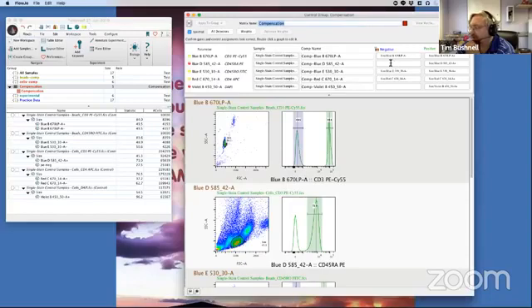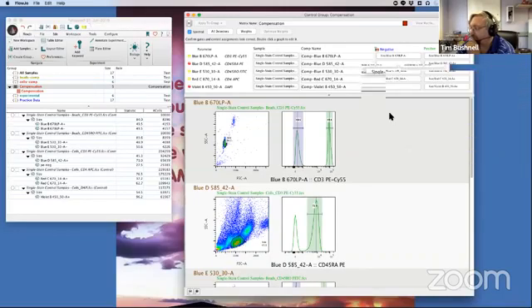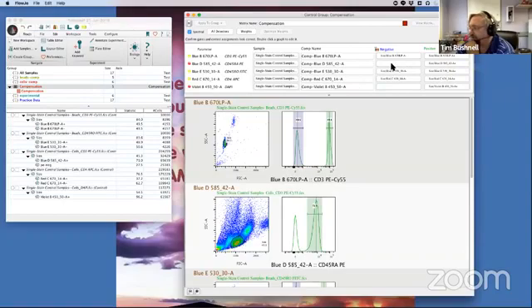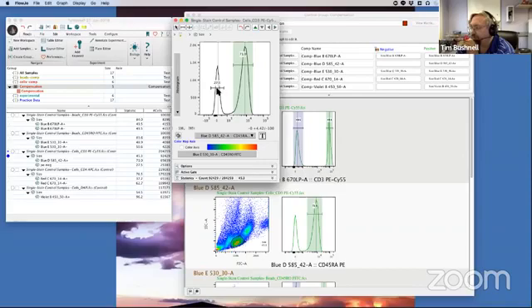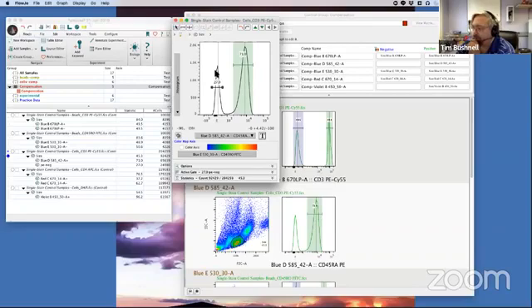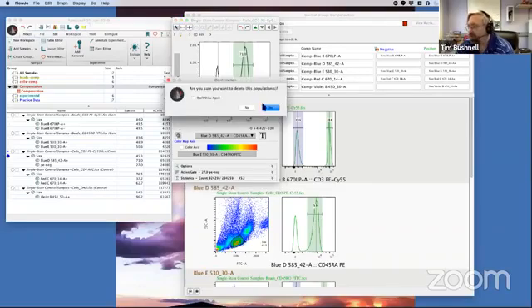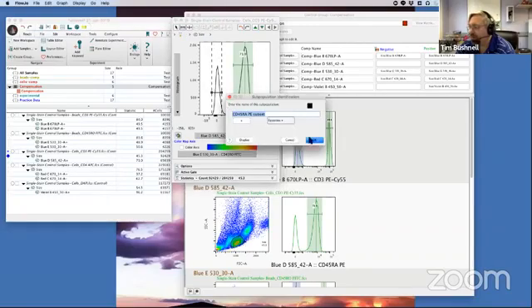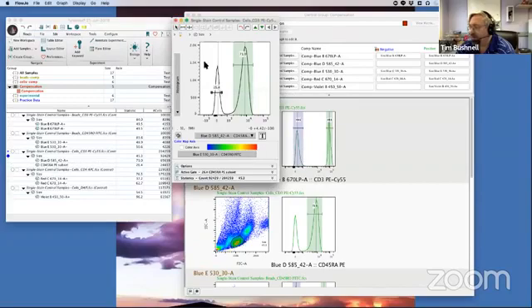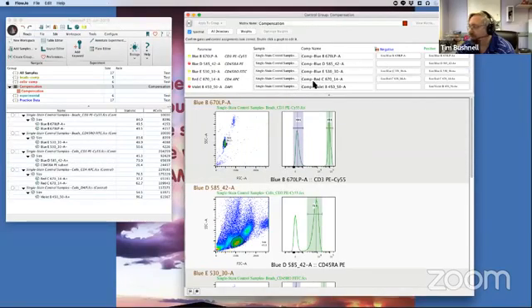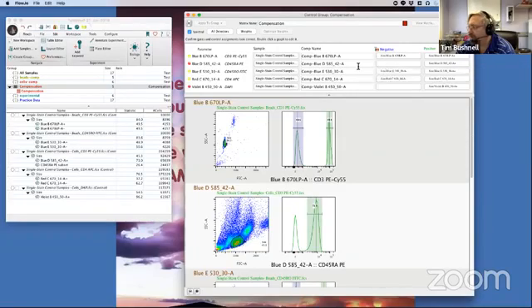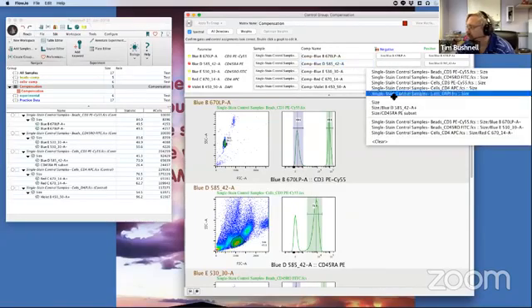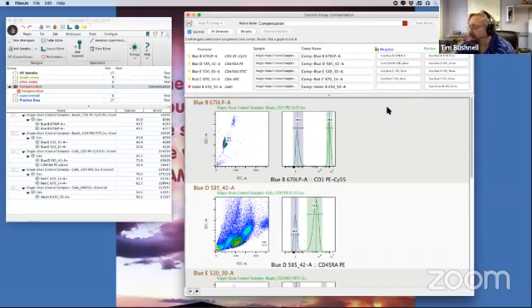Okay, so here's my population. If I double-click through this, and we set this up as a histogram, you'll see we can now come in here and adjust the positive. And then we can put a second population on here. We can call this our negatives. I'm going to close out of here and here. And so now up here, I have to come, and I'm on the top again, under the negative window, and I'm going to have to indicate what the negative is. This is interesting that it's not working right today. This is the newest version of FlowJo, so I'm a little bit perplexed.